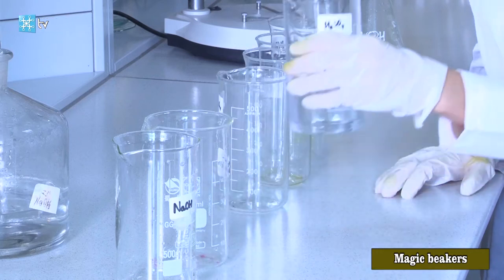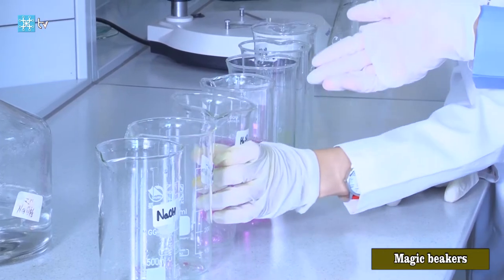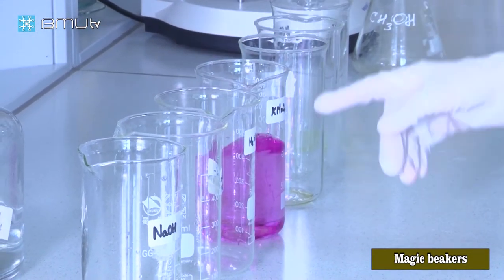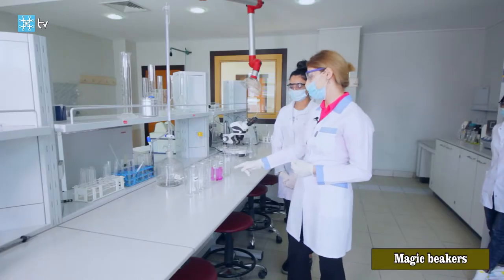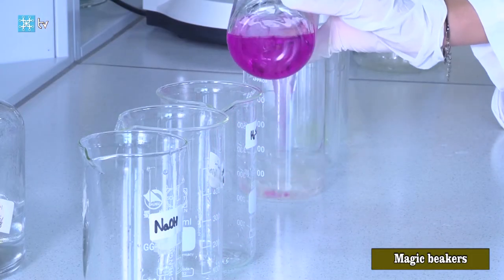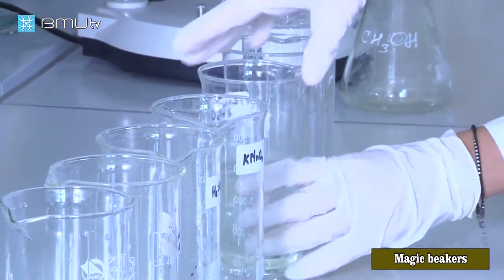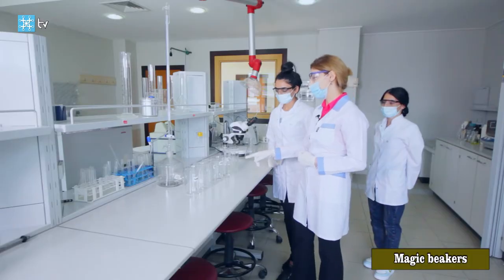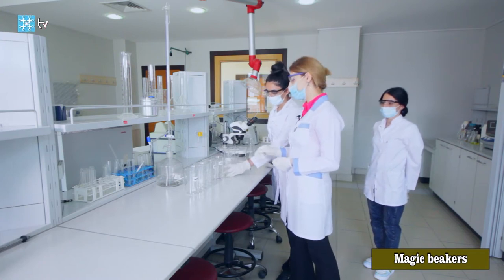When we pour this solution to the fourth beaker, again we will have a pink solution. Why does this color happen? Because of potassium permanganate salt. When we pour this solution to the fifth beaker, we will get again a colorless solution, because ferrous sulfate heptahydrate is present, and manganese is reduced from oxidation state 7 to 2.